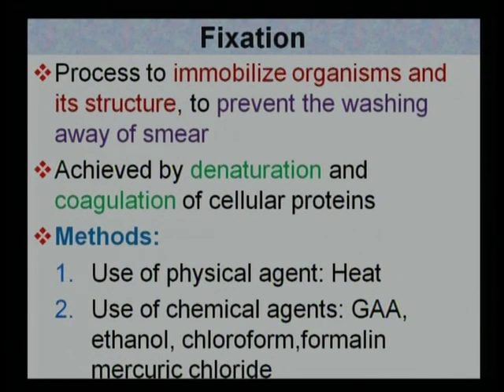A smear is made on a slide, and it is fixed with a fixative. That fixative can be heat or some chemical compound. Normally in routine procedures we use heat as a fixative. That will immobilize the cells and adhere the organisms on the slide.